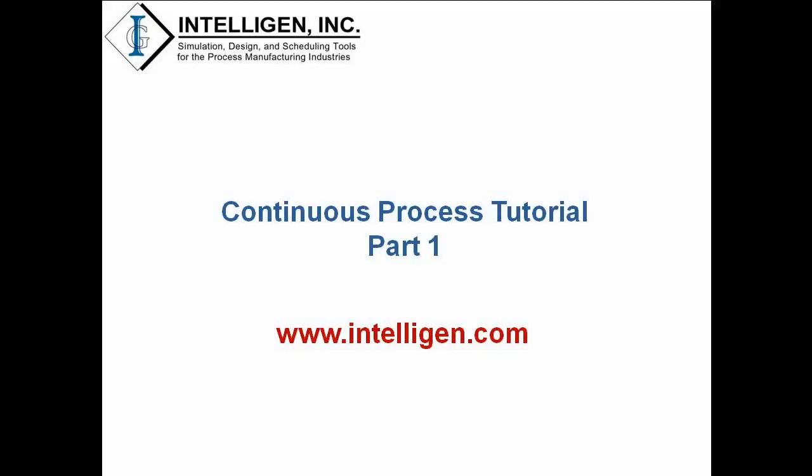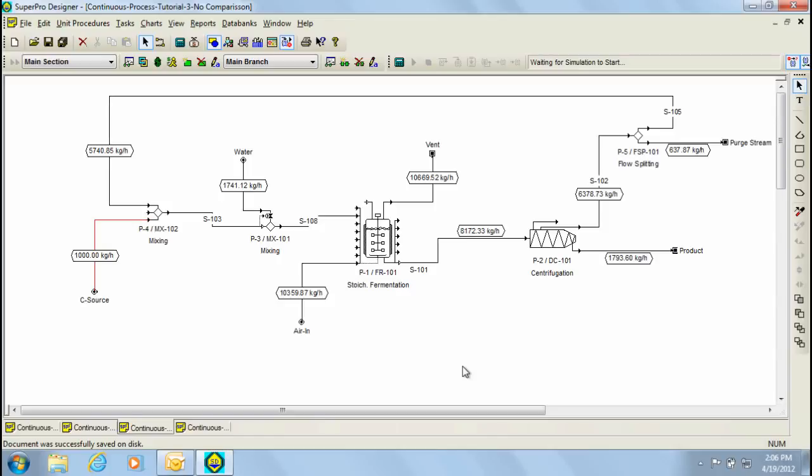Let's now switch to the example I'll be discussing in this tutorial. Here you see a simple continuous process that has been created in SuperPro. The model has been built to represent the production of biomass, such as baker's yeast for example, and to separate it from the main solution. Notice as well that a recycle stream has been added in order to minimize the biomass loss and increase the substrate consumption.